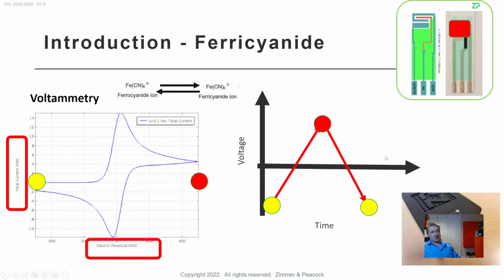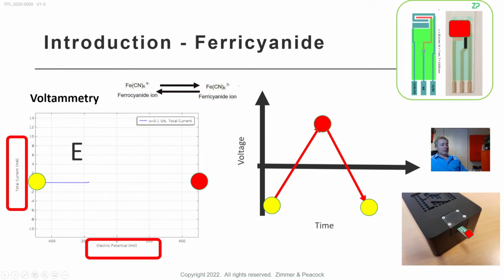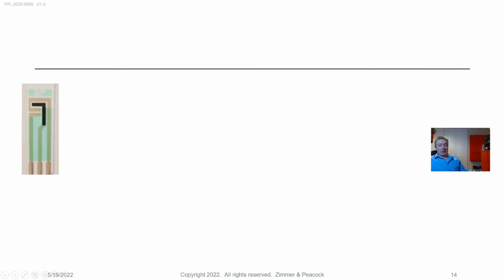It's not hard. You just put the sensor or the electrodes in the front of the potentiostat and put a drop of, this is the anapot and this is the hypervalue electrode, and you just put a drop of something like 5 millimolar ferricyanide. It's fine to do this in about 1 molar KCl, and it should work perfectly fine. It just happens to be what we call an E reaction, because it's just a 1 electron transfer back and forth. I realize that that's in the way. I will go a bit quicker now.